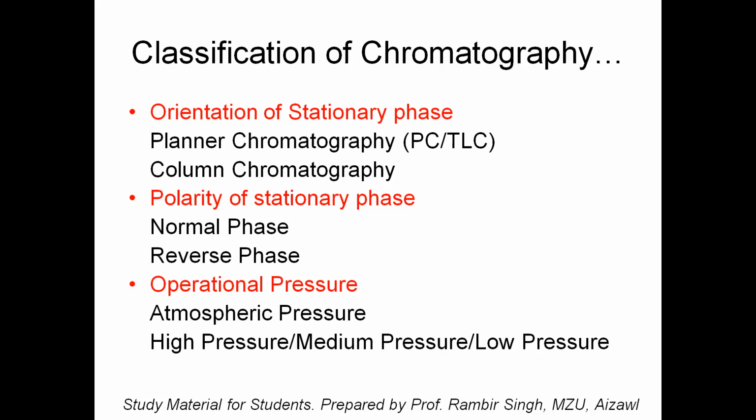So if I want to use water as a mobile phase on silica, I can use it, right? Although separation is a little bit difficult, because you have a highly polar stationary phase and a highly polar mobile phase. The interaction becomes so strong that the separation becomes very poor. But yes, water can be used as a mixture with other polar solvents like methanol or ethanol. You got it?